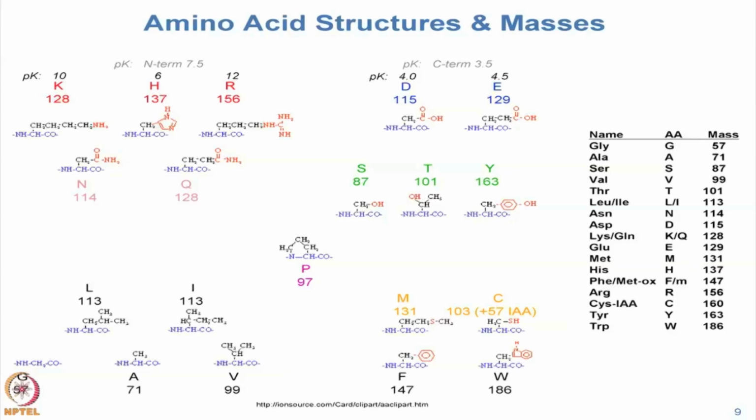So later when we interpret spectra by hand, if you knew all the masses, you would be able to keep up with me. I have a big advantage over you that I just know all my amino acid masses, okay? So after we do some math, I can just tell you right away what the amino acid is, okay? You're at least gonna know tyrosine is 163, okay?